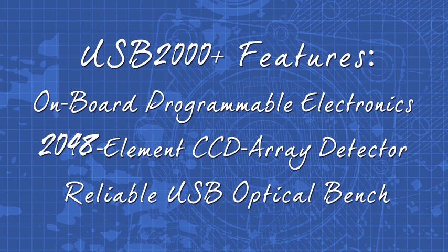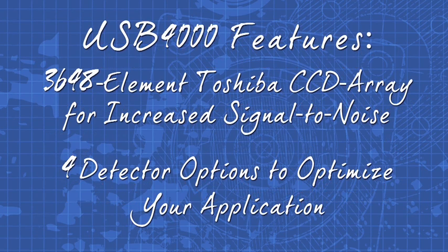It features a 2048 element CCD array detector and optical bench that have provided superior performance to hundreds of thousands of users in the field. The USB 4000 features enhanced electronics and a 3648 element Toshiba linear array detector. Choose from four detection options to help you configure the system which fits your application best.